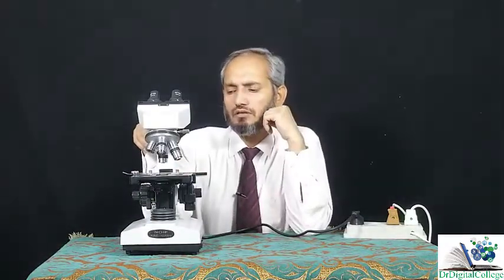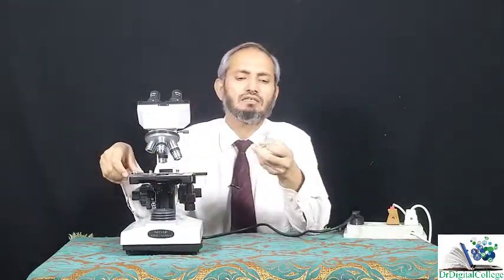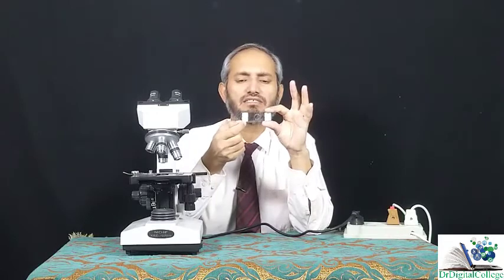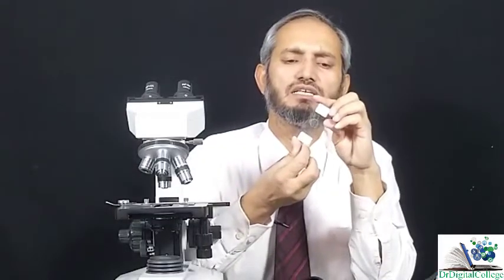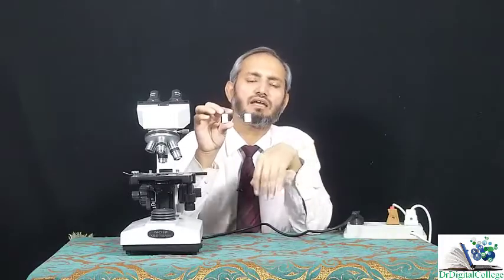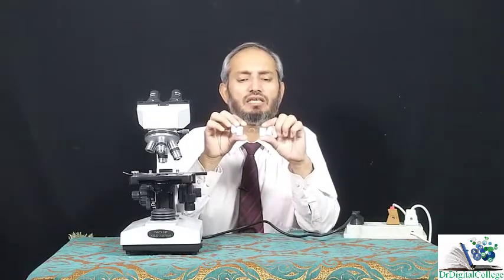Now, this is all about the magnification, and next we will go for the resolution of this object. Before that, I want to tell you that the slides used in A-level practicals are your actual exam slides. If you can see, it is written here Cambridge International Examination, and this is slide N1 June 2013 970034. This is the name of the exam when this slide was used. These slides are purchased from the British Council and are very expensive, so you should take care that they are not broken.